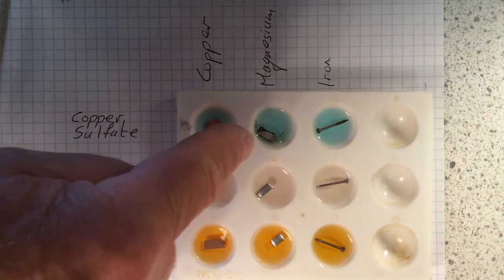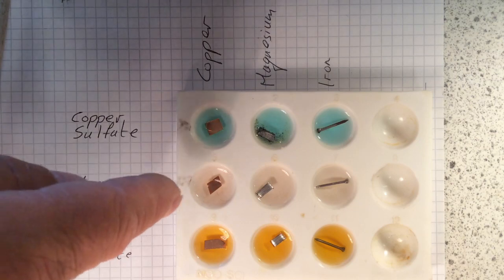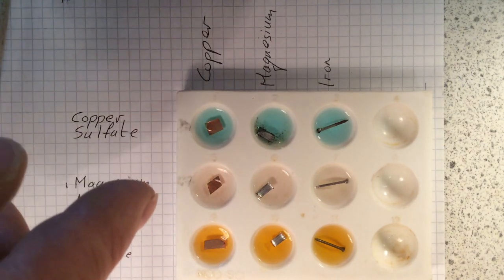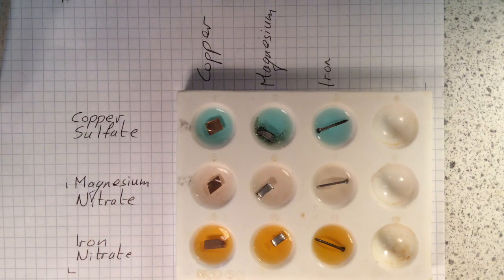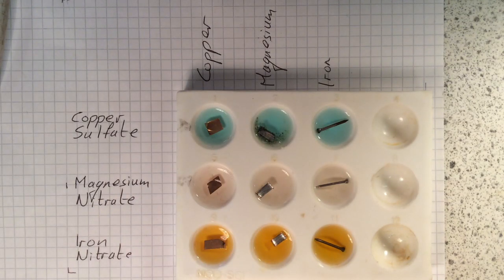See, if you look here, the copper sulfate, copper's hanging on to some sulfate, magnesium comes along and it's taking it away. You can see there's a reaction going on there. What about the copper and the iron? Now if you look at that little nail that's in there, the tip of the iron nail has changed. It's gone like a coppery colour. So the copper sulfate reacts with the magnesium and the iron. So that tells you that magnesium is more reactive than copper because it's stealing its sulfate away.